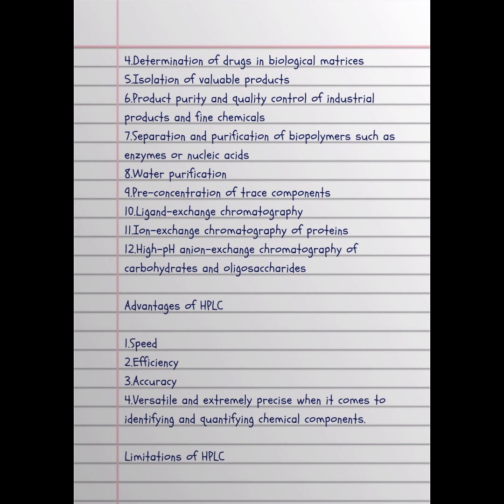Water purification. Pre-concentration of trace components. Ligand exchange chromatography. Ion exchange chromatography of proteins. High pH anion exchange chromatography of carbohydrates and oligosaccharides. Advantages of HPLC. Speed, efficiency, accuracy, versatile and extremely precise when it comes to identifying and quantifying chemical components.